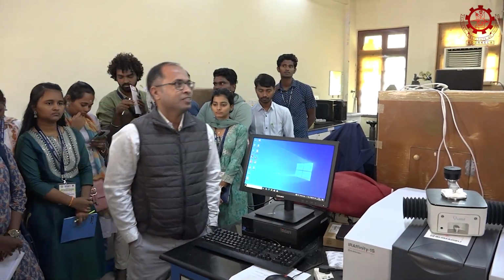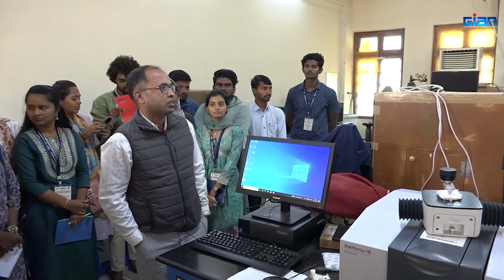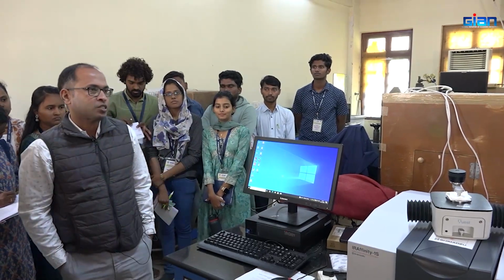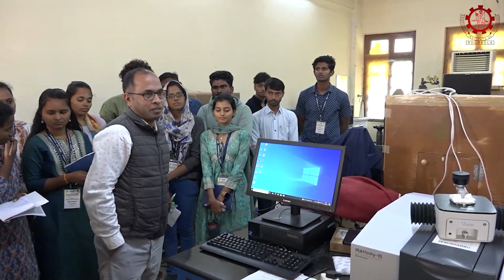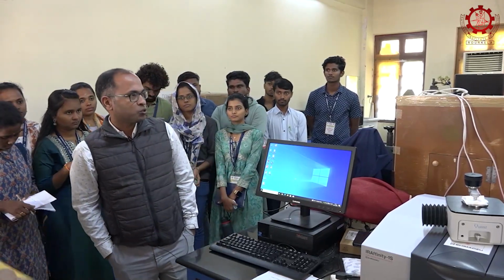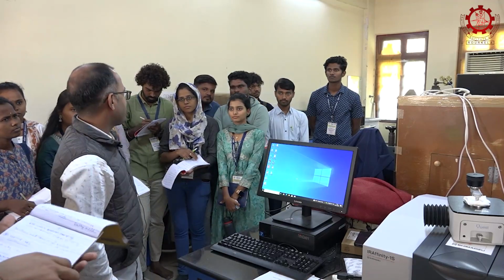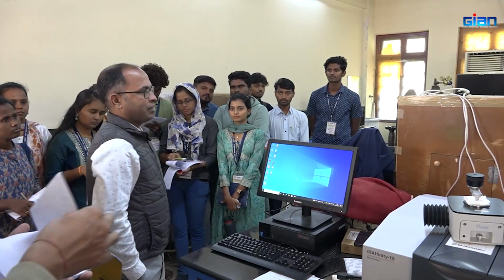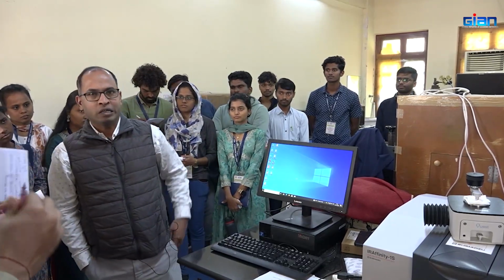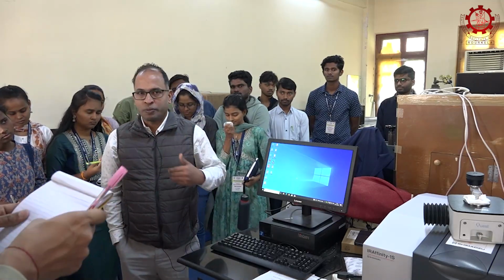Good morning, guys. So, we will be having our demonstration for FTIR, that is Fourier transform infrared spectrometer. First of all, my name is Gokarneswar Sahu. I am a teacher in the Department of Chemistry, and my specialization is organic chemistry. Of course, if you know a little bit about pharmaceutical chemistry, that is our specialization.